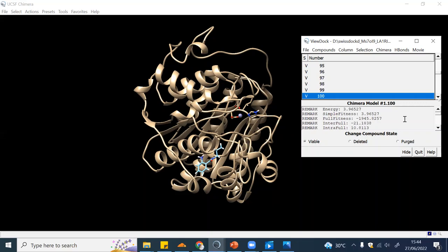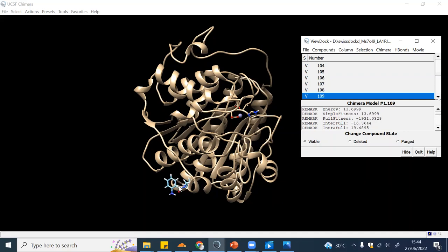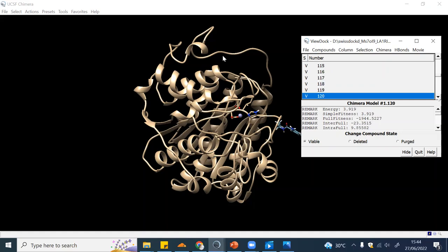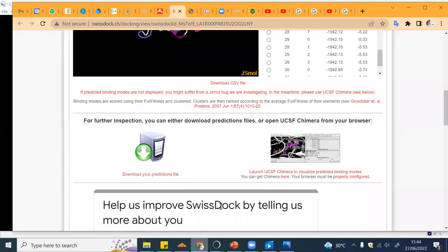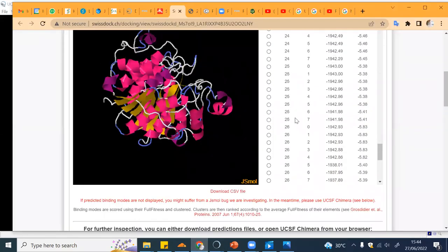You can start looking at different clusters. This is a different cluster than this one, so it has different conformations within this cluster. Later on we will see that this is another cluster. A cluster is basically a position where the ligand can bind, but there will be several conformations.